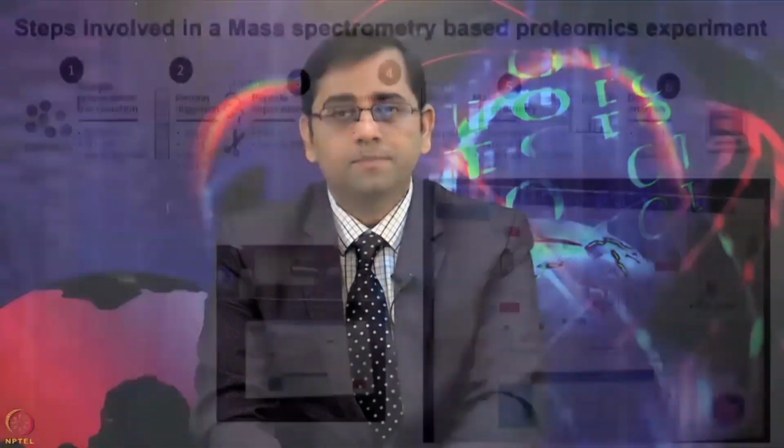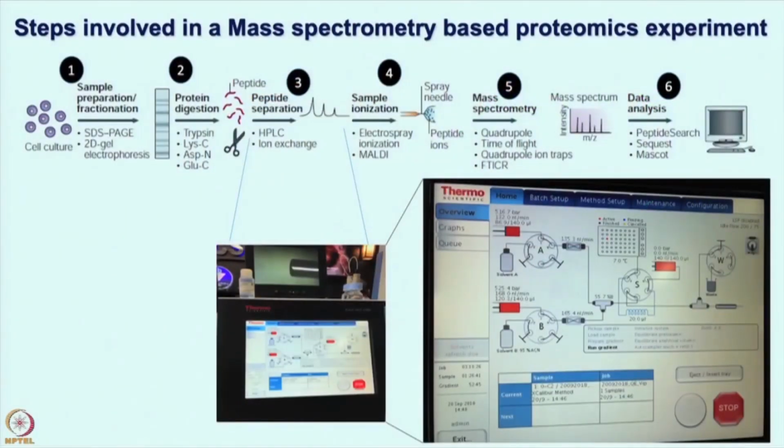Here we are using a reverse phase column with C18 material. Peptides are going to bind to the column and then you want to elute the peptides based on their hydrophobic and hydrophilic properties. So, you will use a gradient of acetonitrile from 5% to 80%, or you can go even up to 90%, with 0.1% formic acid. And this concept I have already briefed in the previous lecture.